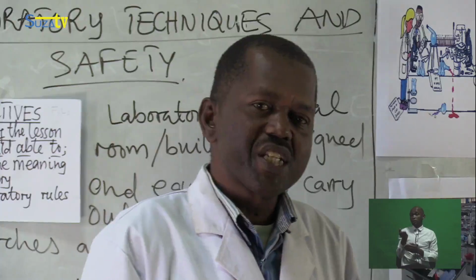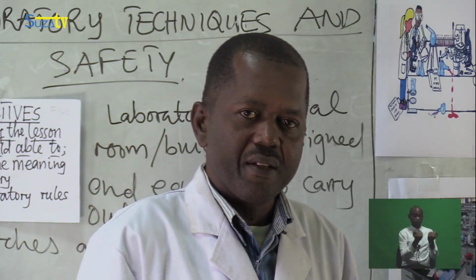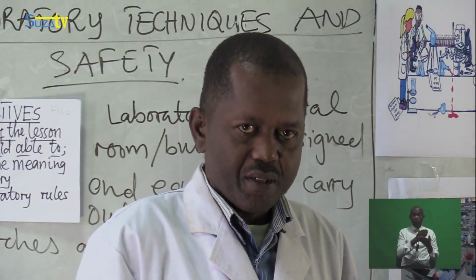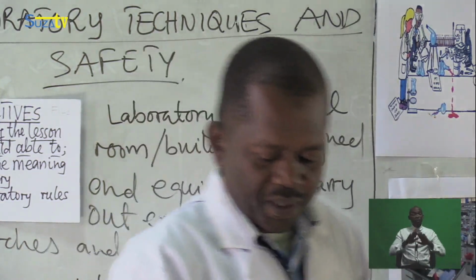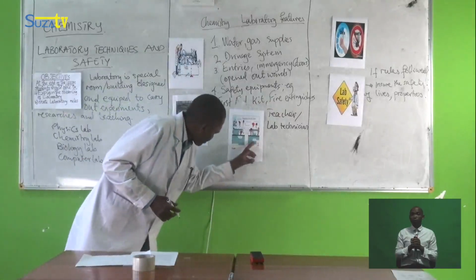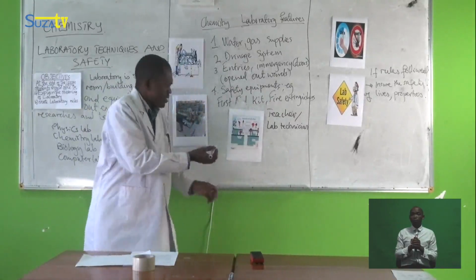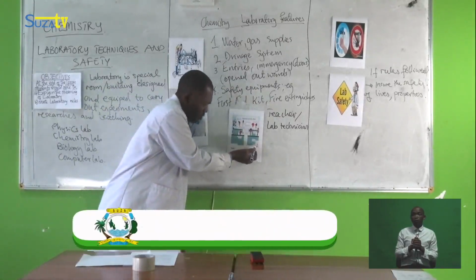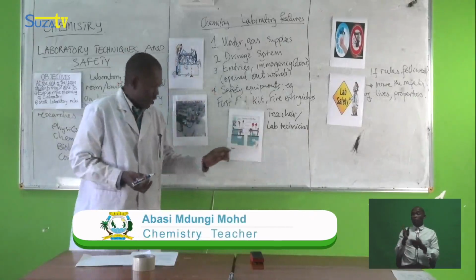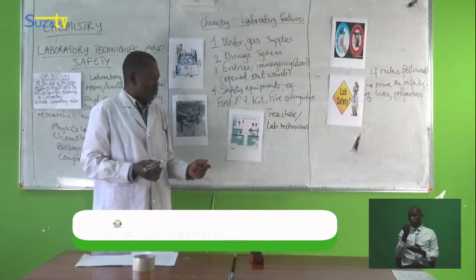Also lab technician makes sure that if there is some repair needed, they should have. Okay, there is a dustbin there, so we have to dispose those waste in this and not just put everywhere.